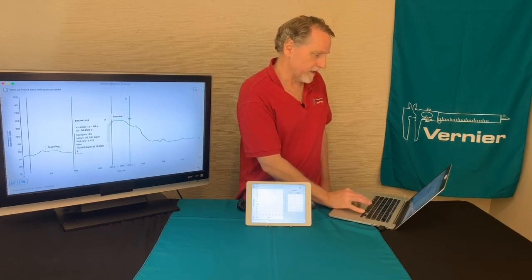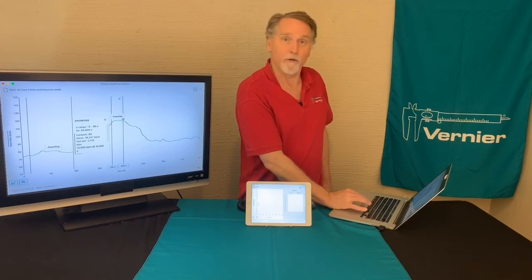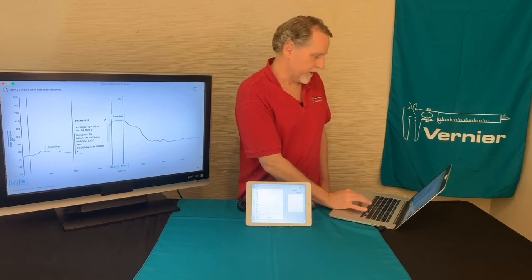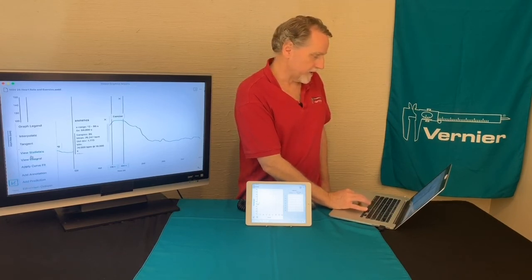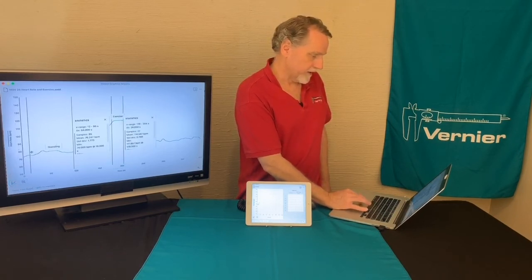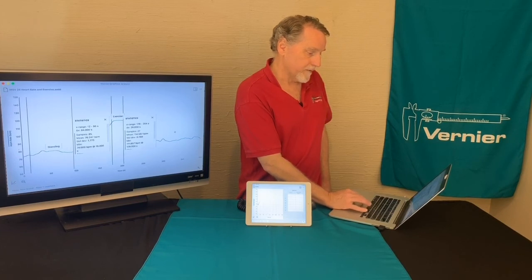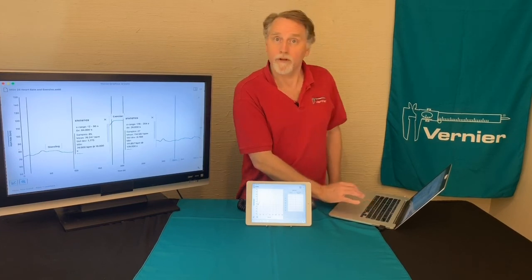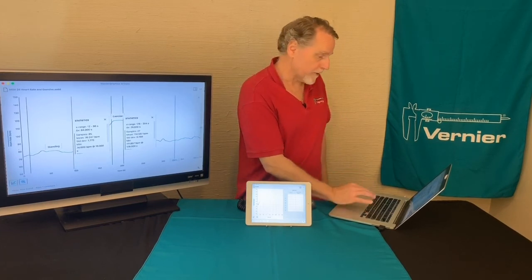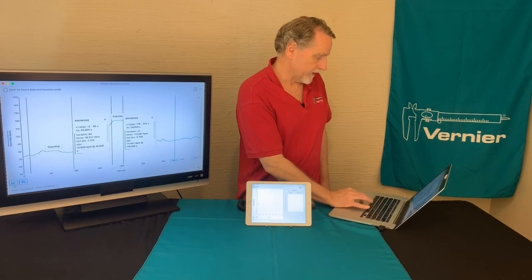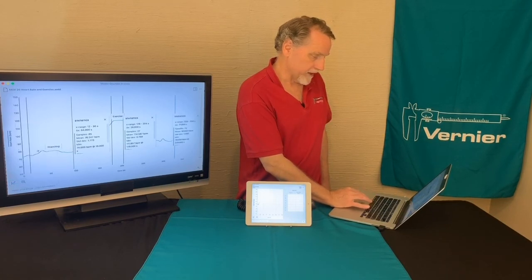I could highlight a region — it's a little bit narrower there when exercising — and do some stats there. Then maybe I come back after recovery and look at what's happening there.